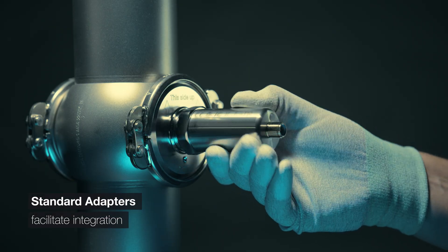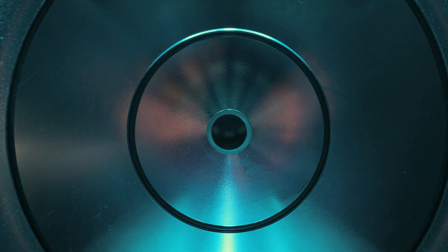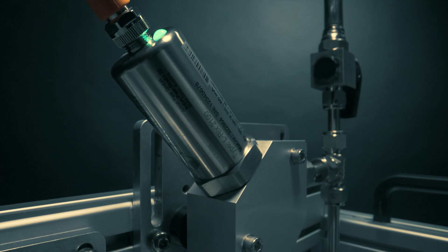The smart adapter design prevents coating build-up and simplifies cleaning, minimizing downtime. Streamline your setup with a single M12 cable.